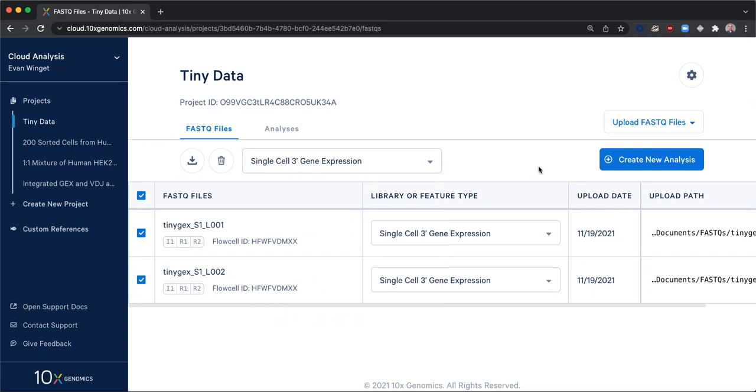We are now ready to create our analysis. These two FASTQ sets represent one sample that was processed through one gem well. These resulted in one library which was sequenced across multiple lanes in a flow cell, creating two FASTQ sets.